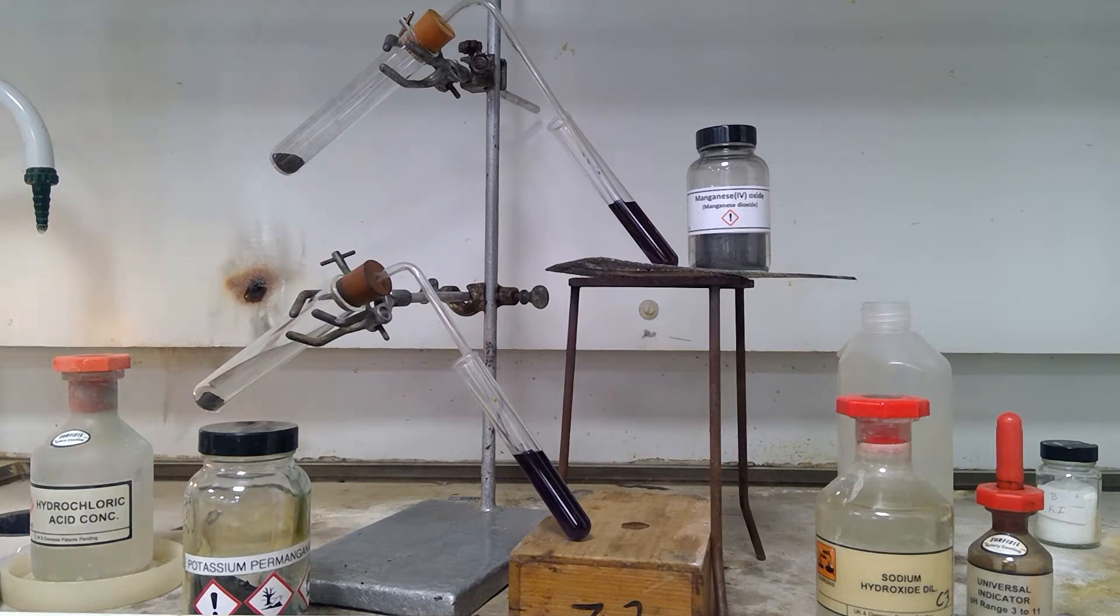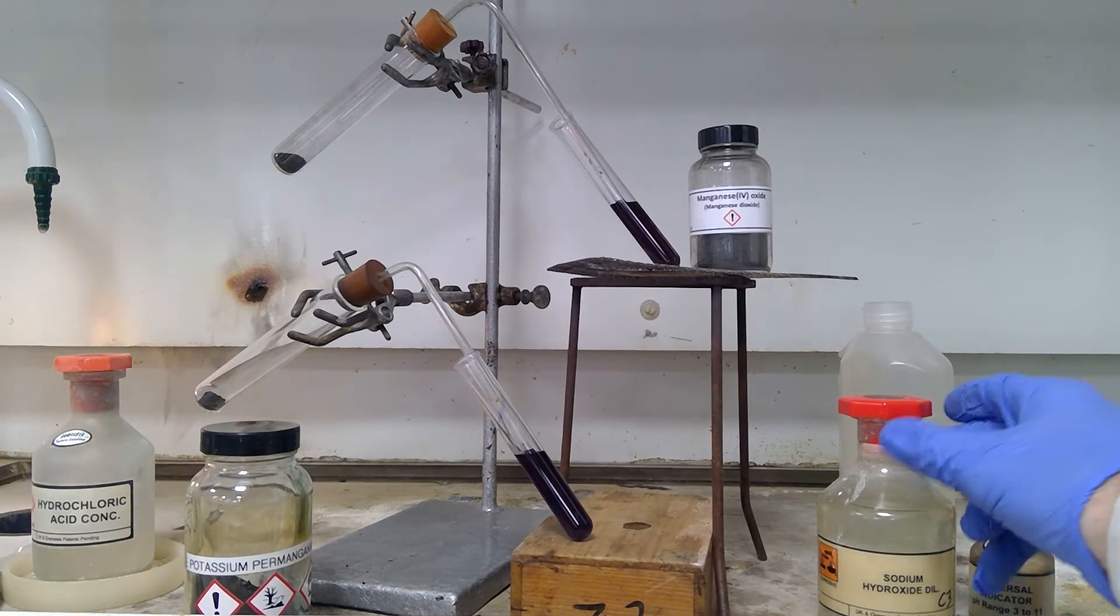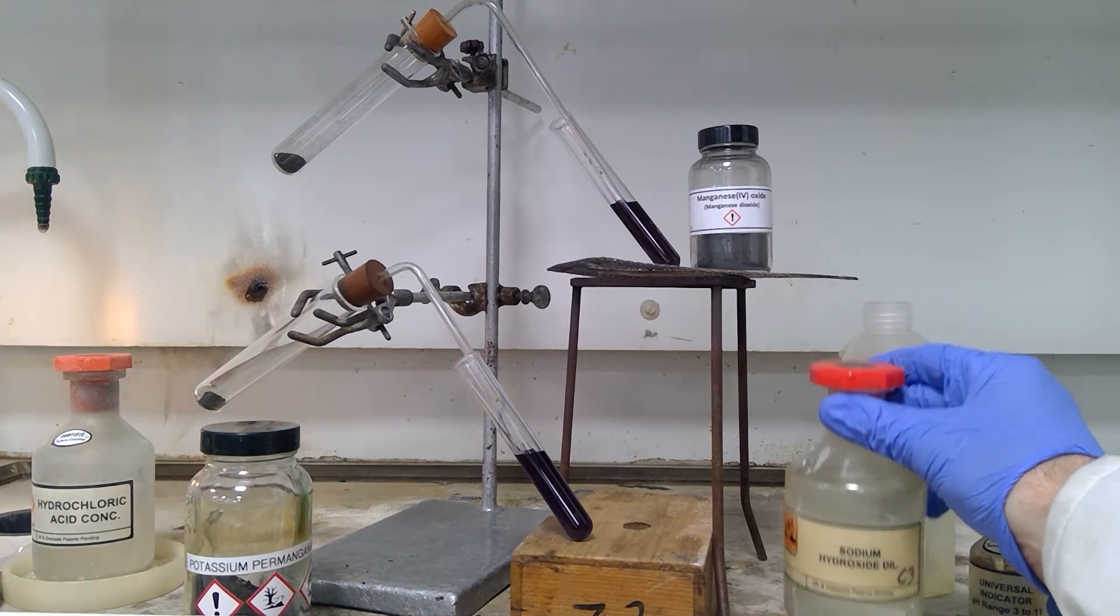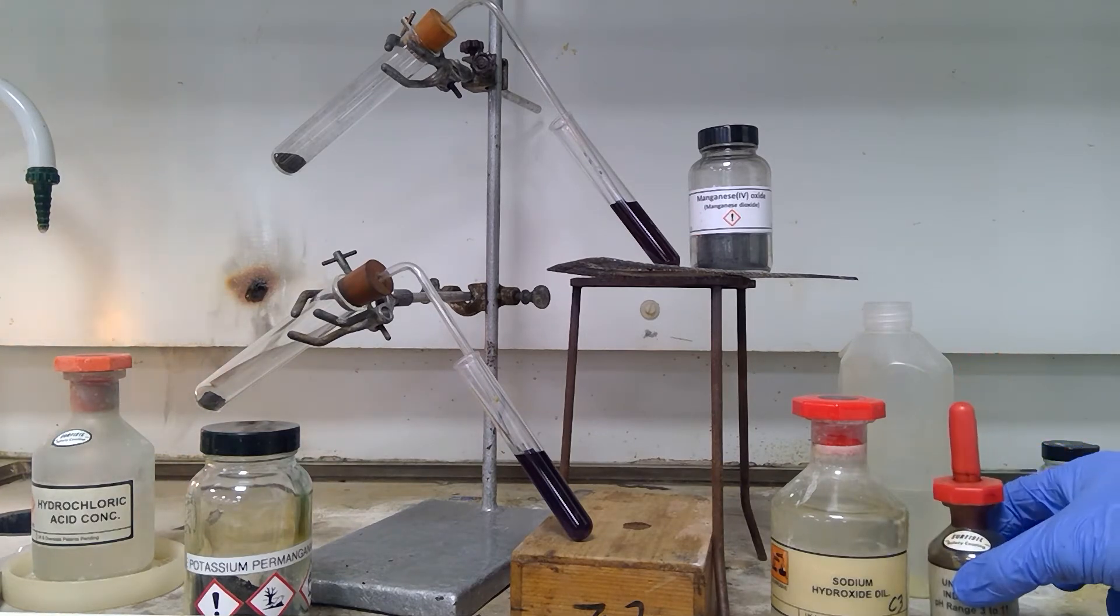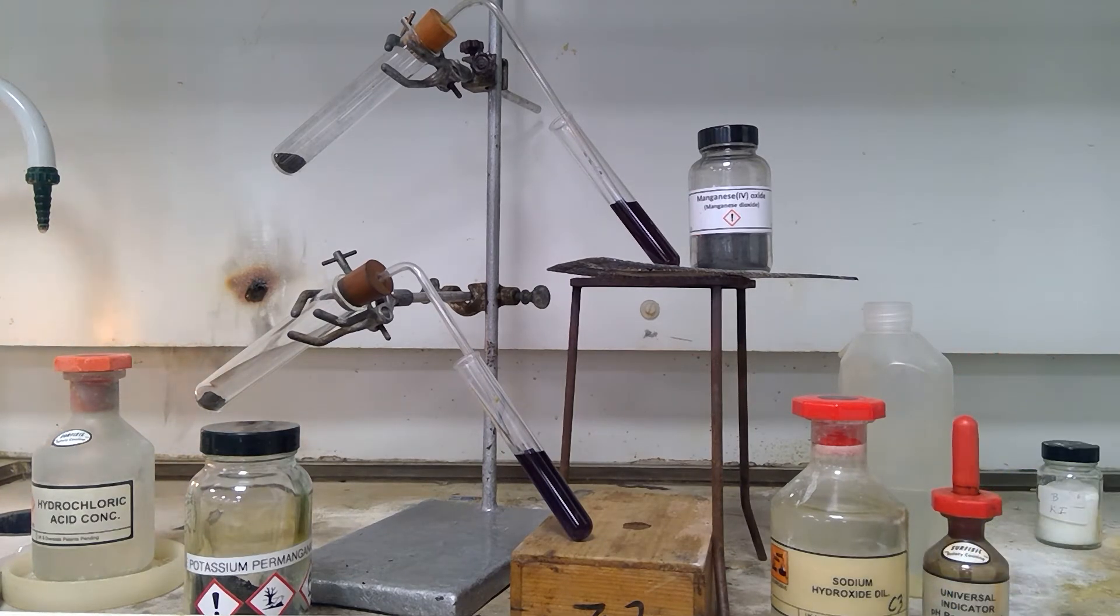In each case, some concentrated hydrochloric acid is going to be added. The gas evolved, chlorine, is then going to pass into some sodium hydroxide solution into which universal indicator has already been poured and added. Although the color is very dark, it is in fact a blue color.